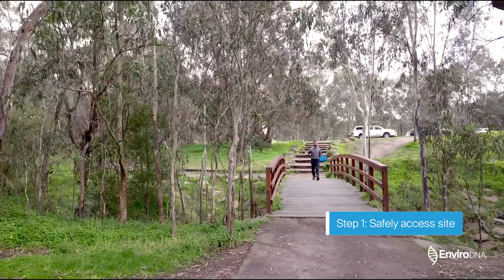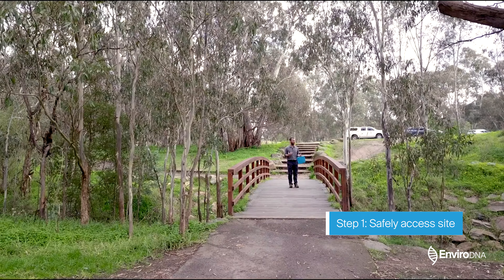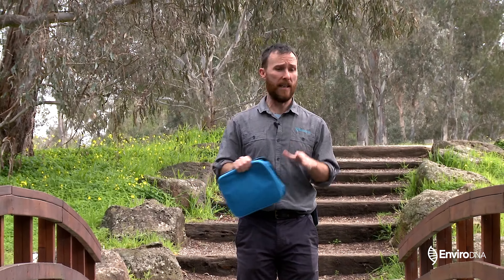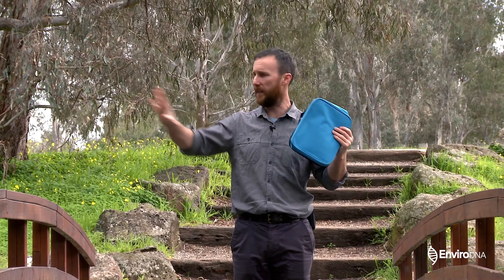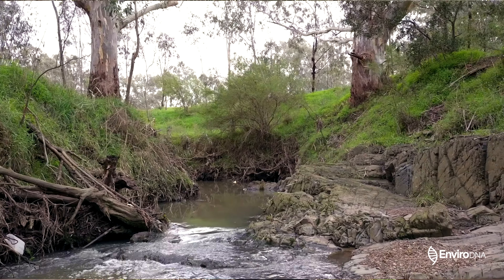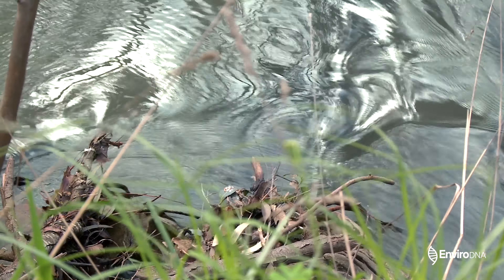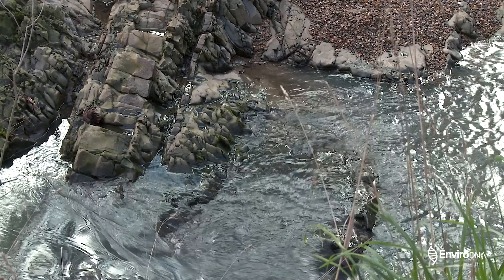The key thing is to make sure that everyone is very safe when taking their water samples. Look out for where you can safely access the water in this area. It doesn't need to be precisely where this bridge is — if there are safer areas a couple of hundred meters up or downstream, you're welcome to try that. Look for banks that aren't too steep, and be careful of crumbling banks, unstable ground, slippery rocks, and mud around waterways.